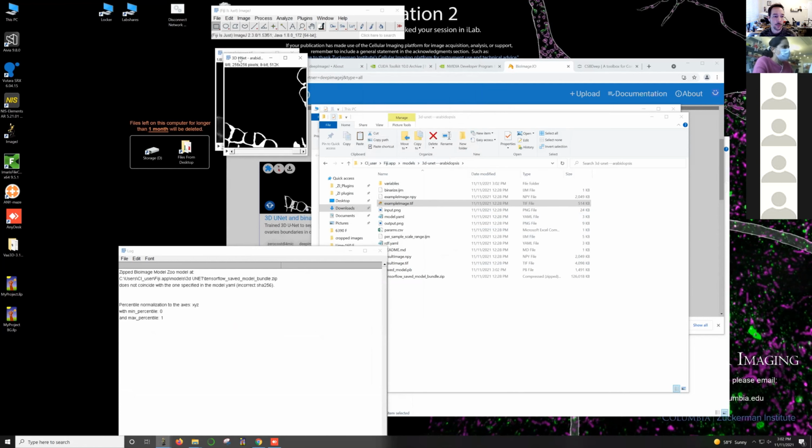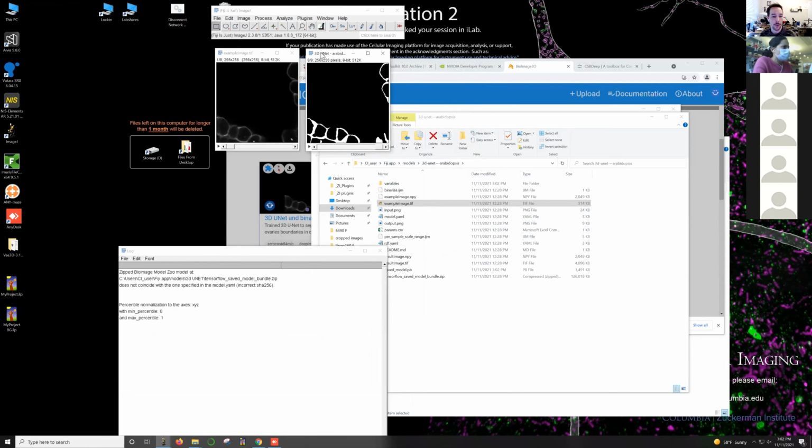And there it is. So we've used that model that someone shared on the BioImage website to do what would normally be a challenging task of getting especially some of these boundaries that are very noisy and weak. To use a classical tool would be very hard to get a good result, but just within a few seconds you've got a great result using this network.